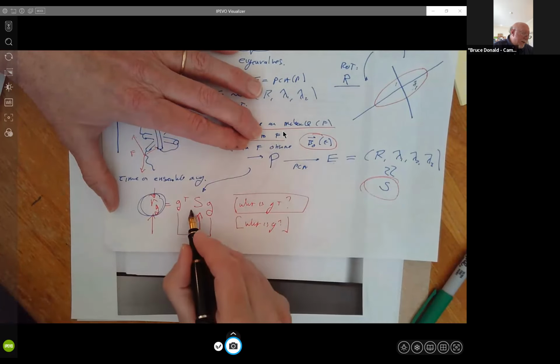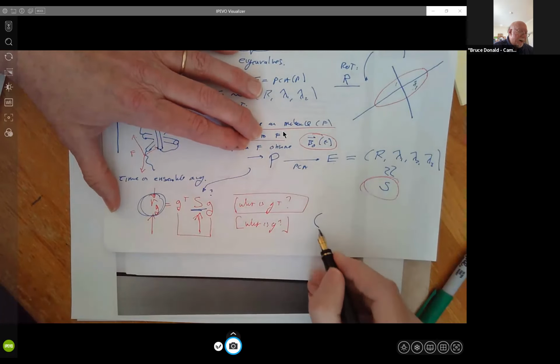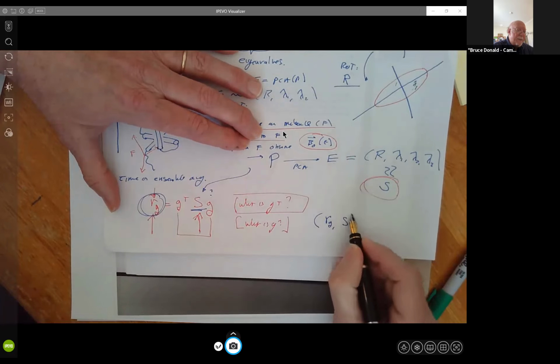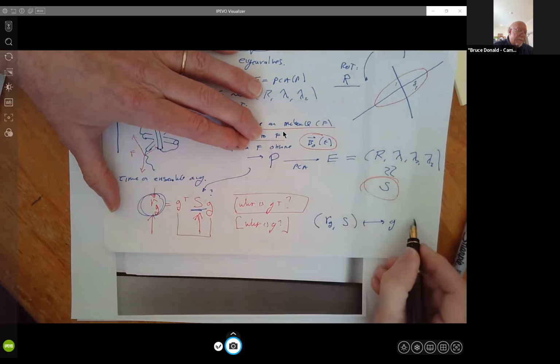So now we know this guy as well, but this guy G is unknown. This is just his transpose. So what does it look like to go from the process of a measured dipolar coupling and an estimated alignment tensor to what G can look like? What does this process look like, right?